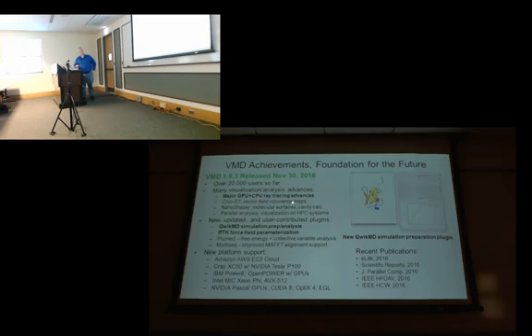VMD can now load vector field volumetric data. It can load large cryo-ET tomograms with support for a bunch of extended forms of MRC files and things written by tomography tools like IMOD. It supports NanoShaper, which is a tool for calculating molecular surfaces and cavities. One of the other things that VMD now is able to do on large-scale supercomputers is to run in parallel. There are new scripting commands to allow you to develop your own analysis workflows that can run on thousands of nodes, and this will allow you to run those things much more quickly than you ever could on a conventional laptop or a workstation.